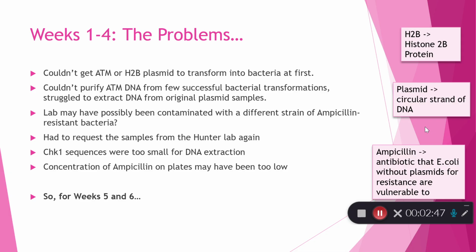So it was suggested that the lab could have possibly been contaminated with some different strain of ampicillin-resistant bacteria, and so that's what I had growing on my ampicillin plates, rather than the ATM plasmid bacteria, but we're unsure. In the end, we had to request the samples of the H2B and ATM plasmids from the Hunter lab again, which obviously took a little while to arrive as they were coming from America.